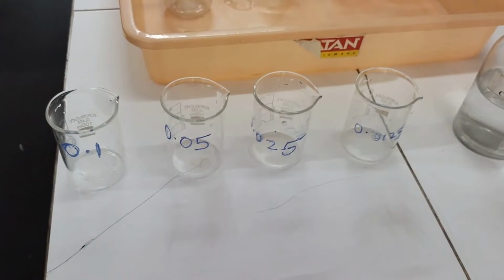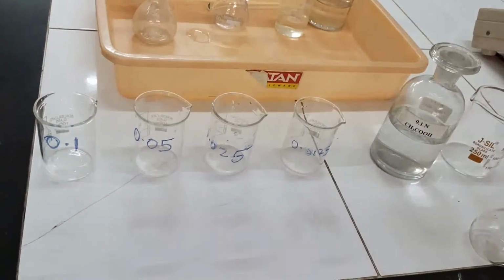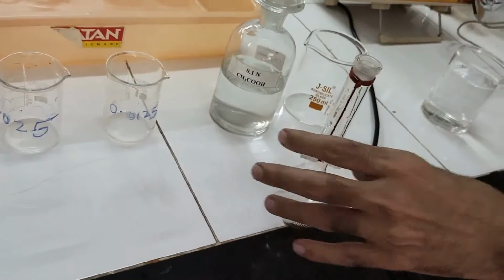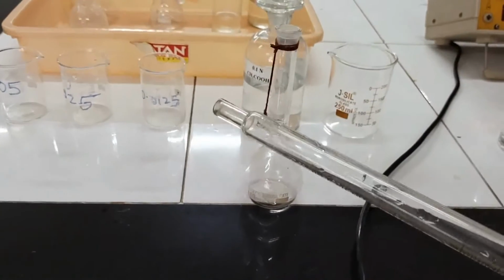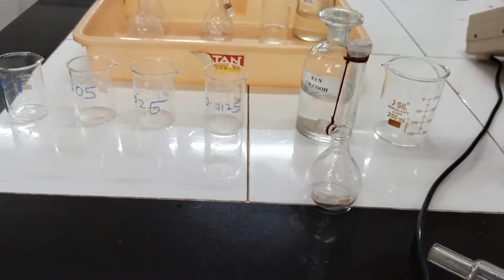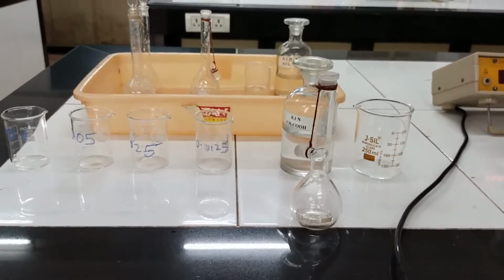I have already explained to you theoretically how to prepare these solutions. Now I actually demonstrate for you. Half of 0.1 gives you 0.05. If the concentration becomes half, it's obvious the dilution has to become twice. This is a 100 cm3 standard measuring flask. We have a 25 ml pipette. Because the total solution is going to be 100 ml, I am going to take 25 plus 25, that is 50 ml of 0.1 normal acetic acid, and then dilute it up to 100. So 50 ml diluted to 100 means twice the dilution, and therefore half the concentration, which is 0.05. Okay, so here we go.